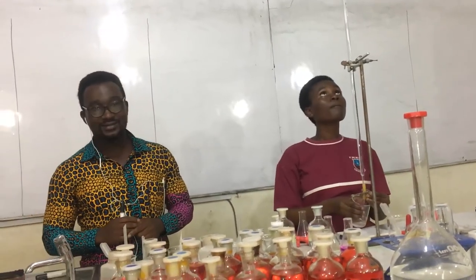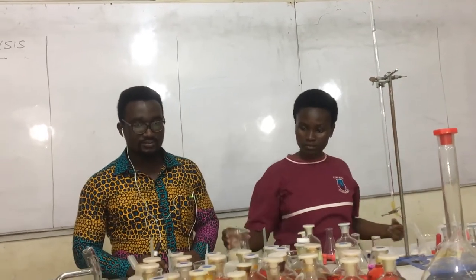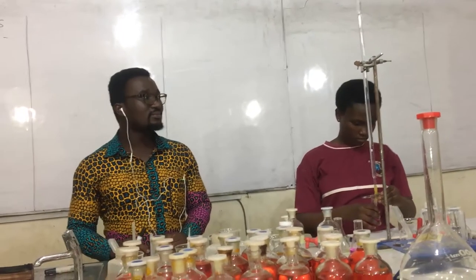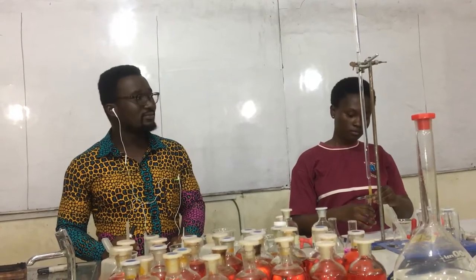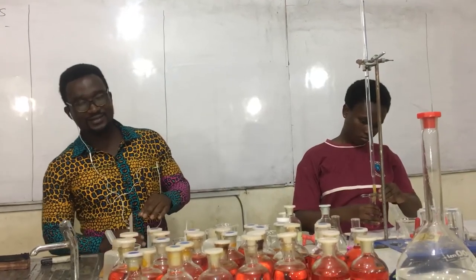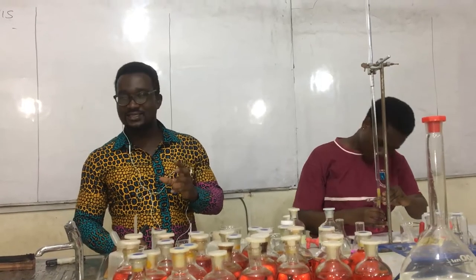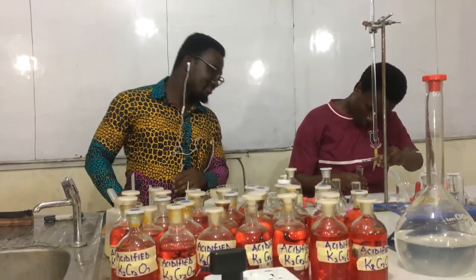See, she's more relaxed, just following the rules, certain principles. So she's going to begin. Once again, the second titration. Remember, everything that you do will affect your titre value. With even a little mistake, you are going to have problems.